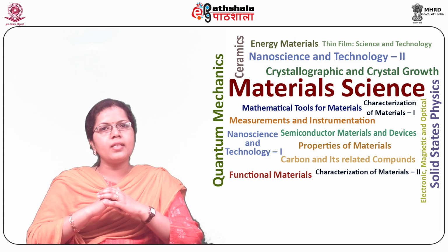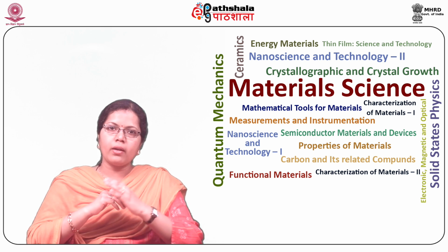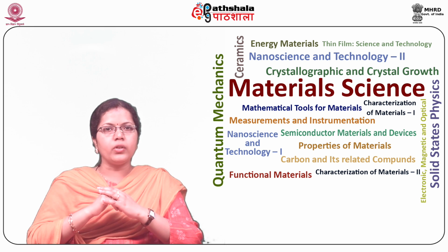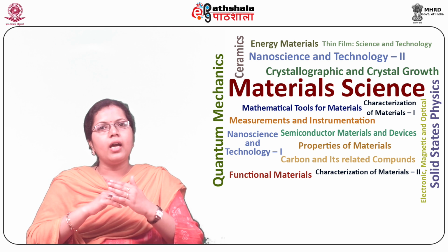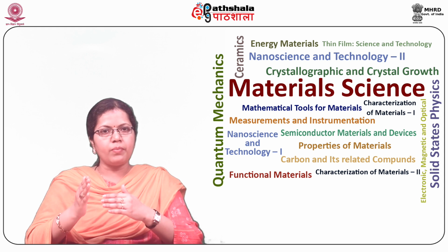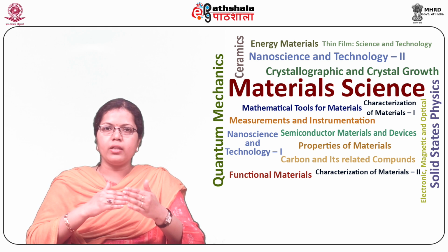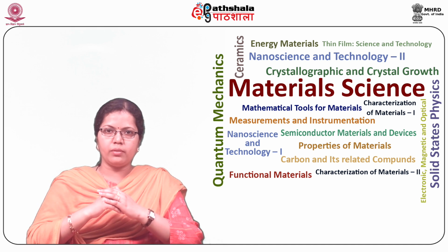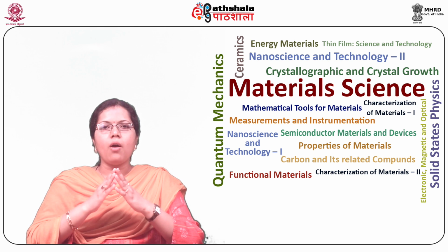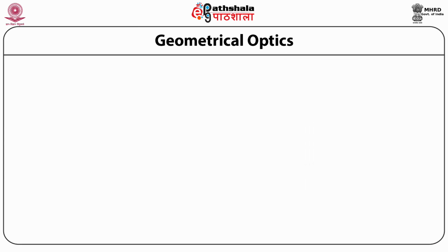But things as small as a virus or single proteins are not visible through the microscope, thereby limiting the utility of this device. In this chapter, we will learn about the fundamentals of optical microscopy, including its working principle, image formation, and adjusting the microscope suitably to make use of its complete potential. Additionally, different optical imaging techniques have also been discussed. Students, now let us see the geometrical optics.